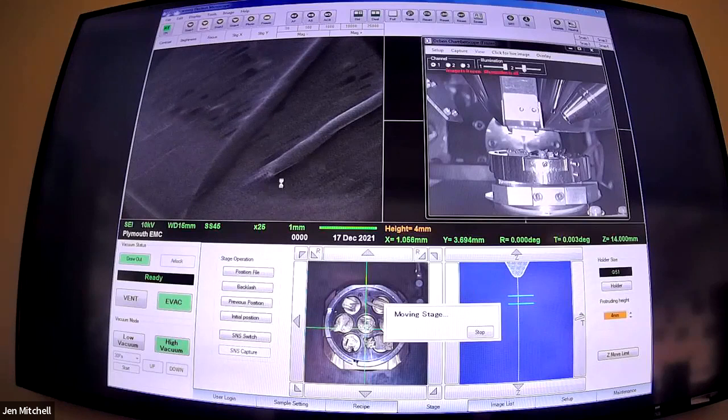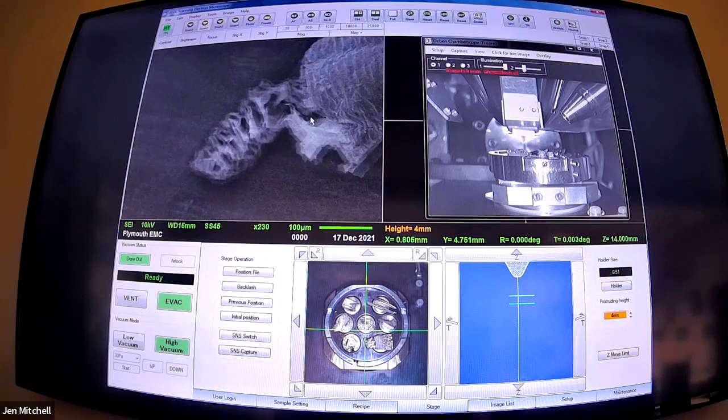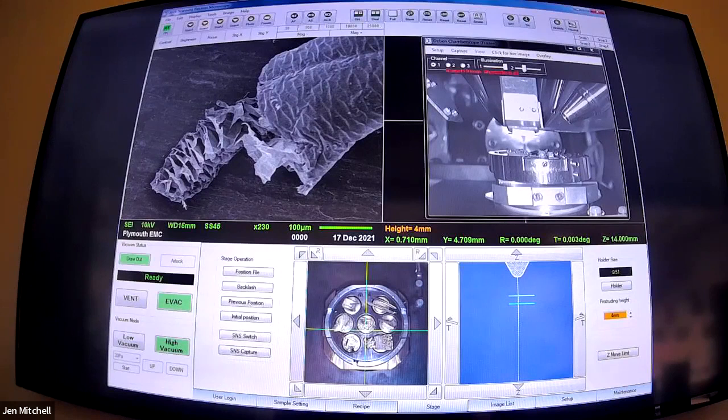We might look a bit like the inside of a bird's bone. I believe it's only the deer family and moose that have this sort of open structure, which will help them insulate. And then those downy very fine hairs underneath trap a lot of air and keep them nice and warm. Makes sense, I guess.